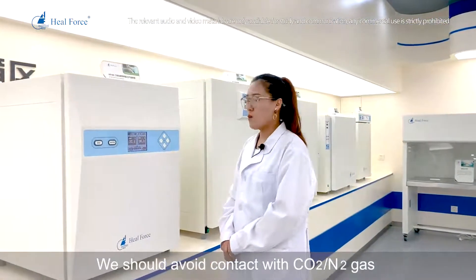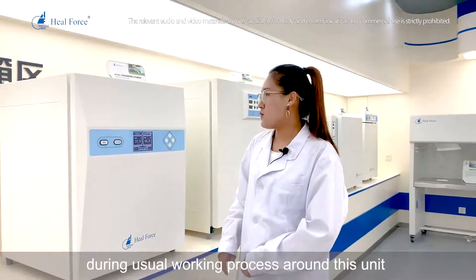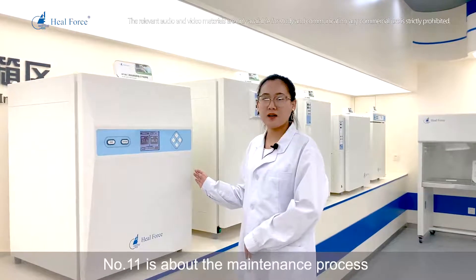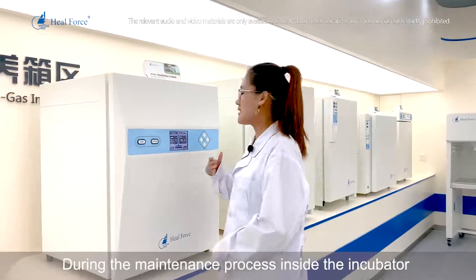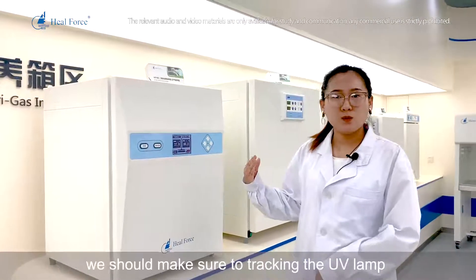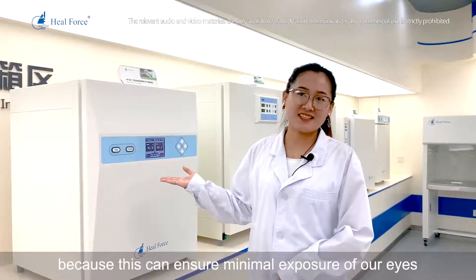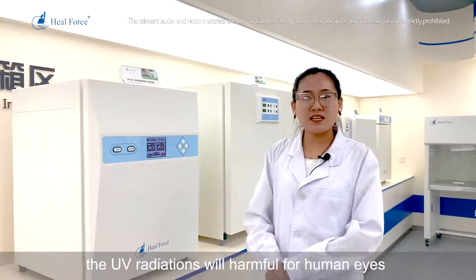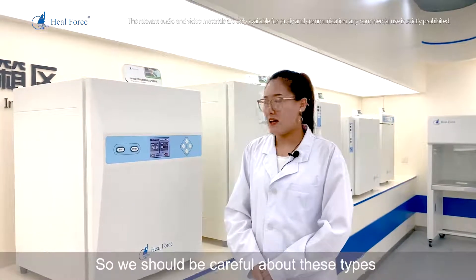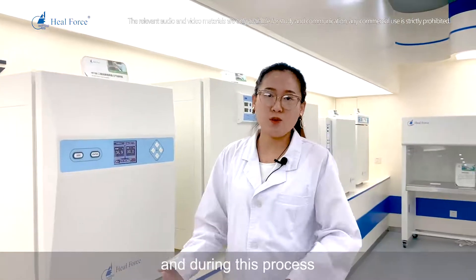Number 10: avoid contact with carbon dioxide and nitrogen gas during normal working operations around the unit. Number 11: regarding maintenance — when maintaining the inside of the incubator, make sure to limit UV lamp exposure to within 10 seconds. UV radiation is harmful to human eyes, so be very careful to protect your eyes during this process.